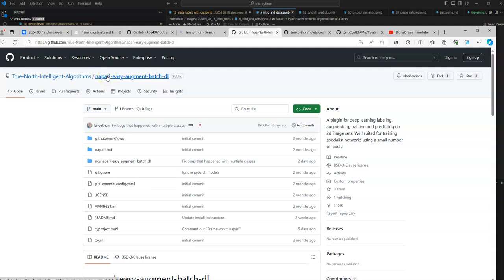It's in the very, very early stages. The idea behind this is over the last year or so, I've been doing a lot of notebooks for deep learning, and I'm starting to think about how I can get some of that functionality behind a GUI. Very early stages, not ready for prime time. I'm only going to use a small subset of the functionality in this example today.